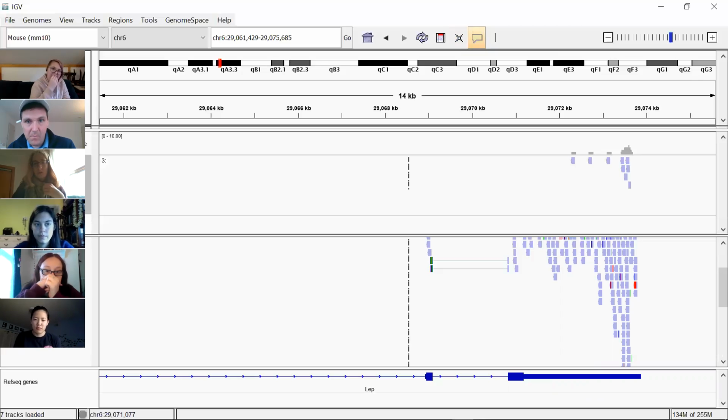So does it have to do with the introns being removed and we're not reading the entire gene? Right. In an RNA-seq experiment, you typically sequence cDNAs that have been reverse transcribed from mRNAs. The mRNAs don't have the introns, so we're just sequencing cDNA, not actual genomic DNA. So yeah, they're not there.